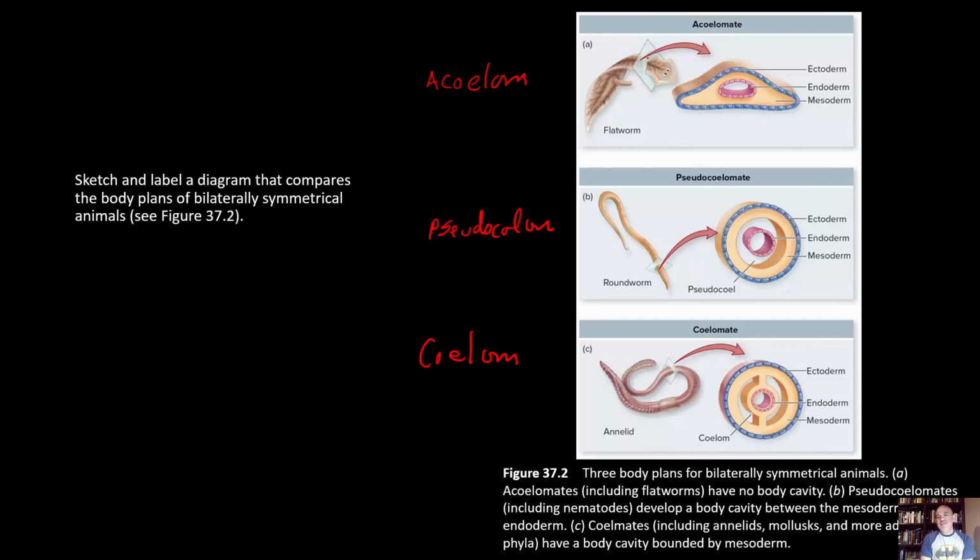Here they've taken a section through a flatworm. You can see the head of the flatworm right here with two eye spots. Sometimes they call those ocelli. It's a pretty simple animal here.